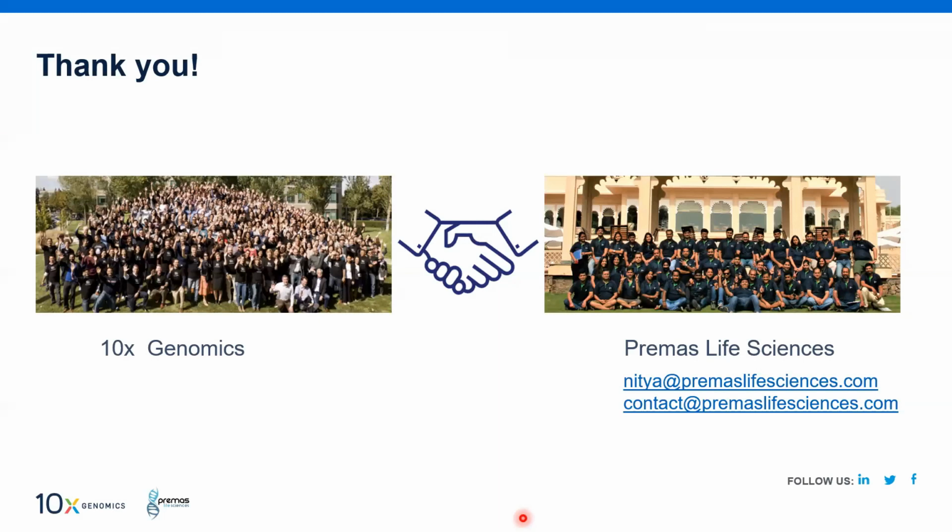There is one question from someone interested in minimal residual disease in hematology. From the bone marrow point of view, there is high heterogeneity. What is the accuracy that is followed? In terms of the rare cell population, we can pick it up. We are capturing all the RNA data of individual cells, so you are getting the complete story. It is not based on a very specific marker where we might miss something.